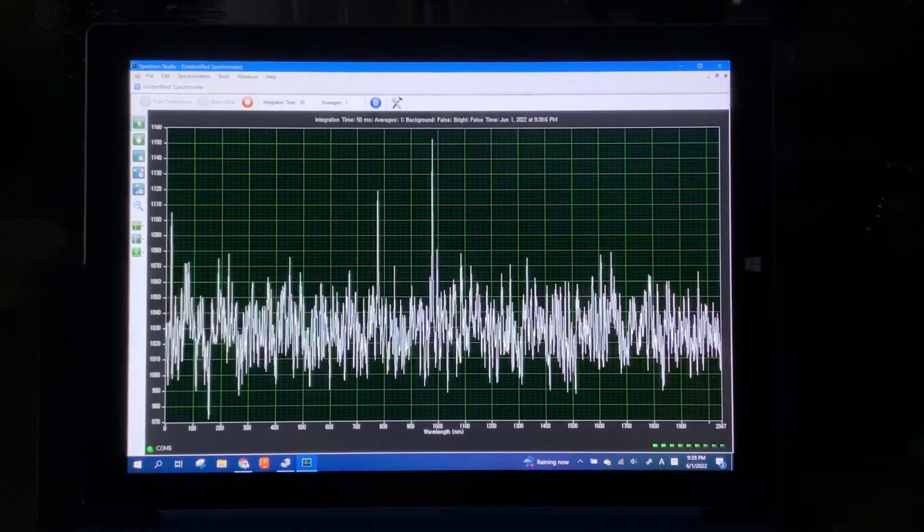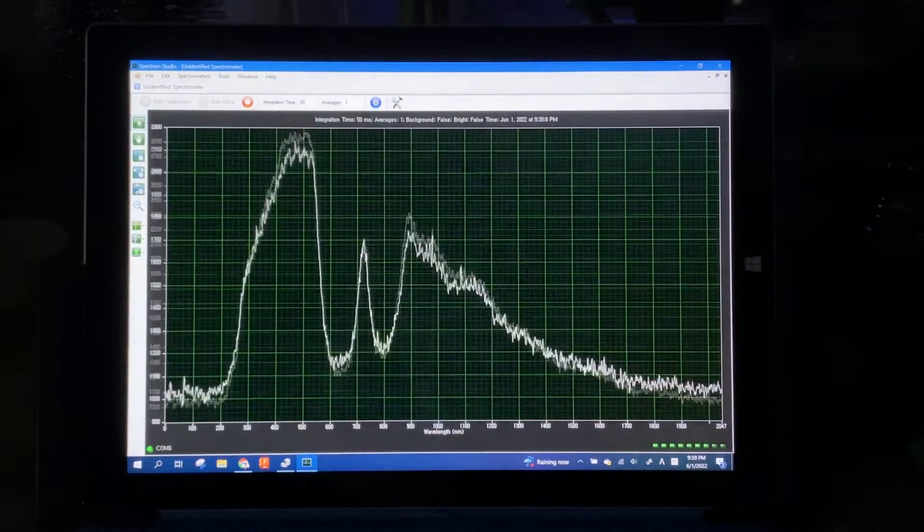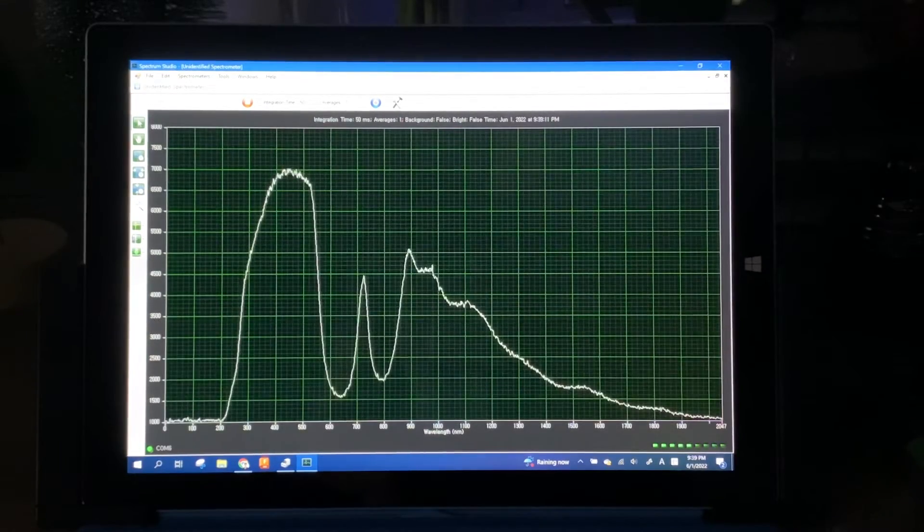This is the spectrum of a UV flashlight, and it has a peak of about 400 nanometers, which is about right.